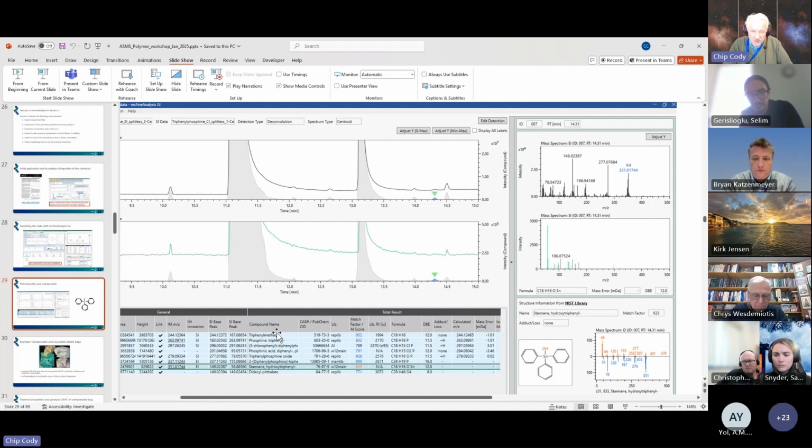But in most cases, the automation is pretty good. For 1D GC, it takes only a few minutes to do the analysis. I'll usually stop and proofread the peak detection and deconvolution first, though, to see if I think the parameters are catching all the peaks of interest. So I'll have it halt after peak detection, inspect it, redo the peak detection if necessary, then I'll let it proceed with the analysis.